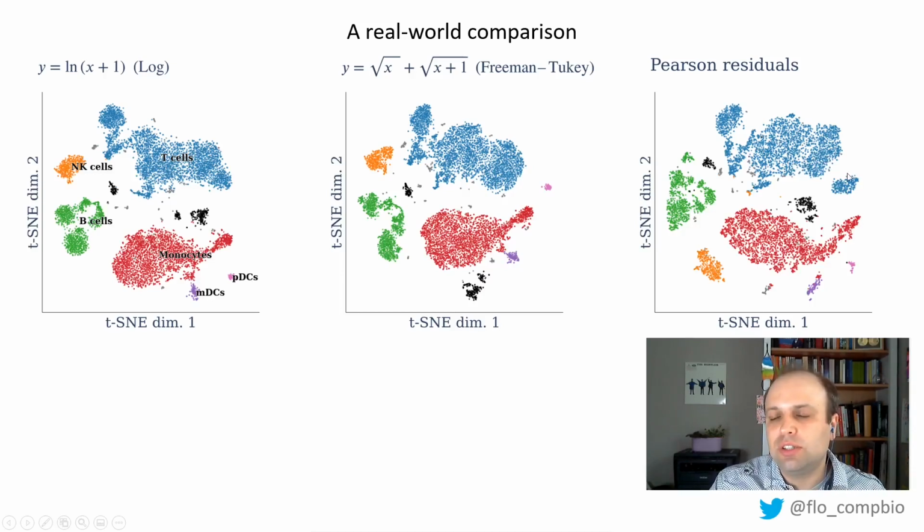They only express, I think, a couple of genes that are different from the CD4 positive naive T cells, and yet they get separated into their own cluster. And I assume that's because CD8A and CD8B, even though they're maybe not super highly expressed genes, are fairly cell type specific. They're only expressed in CD8 positive T cells, and maybe with the Pearson residuals, that's enough to separate them out as a cluster. So I think this is an interesting example.